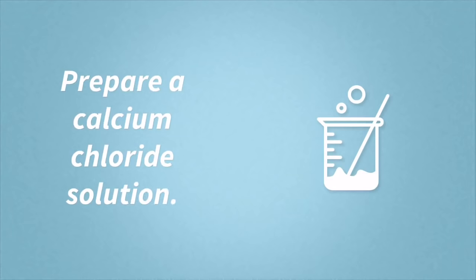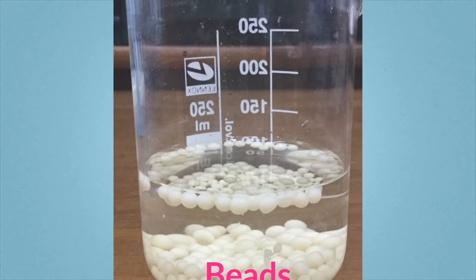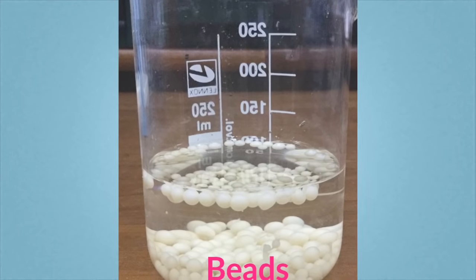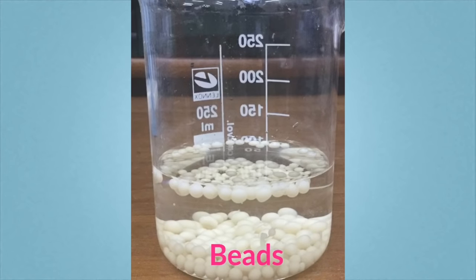Separately, a calcium chloride solution was prepared. The next step involved drawing up the yeast and sodium alginate mixture into a syringe. Very slowly, small amounts of the yeast and sodium alginate mixture were dropped from the syringe into the beaker of calcium chloride solution.